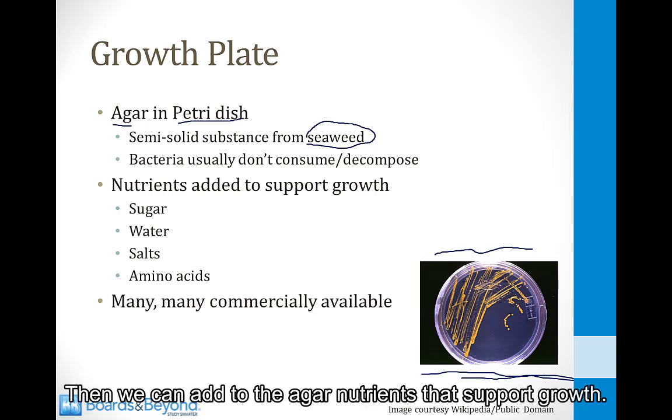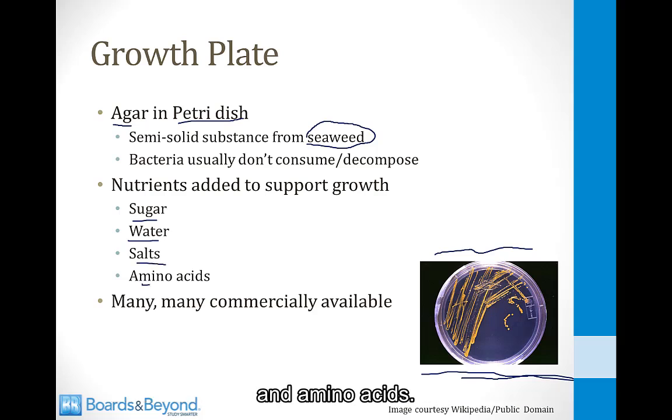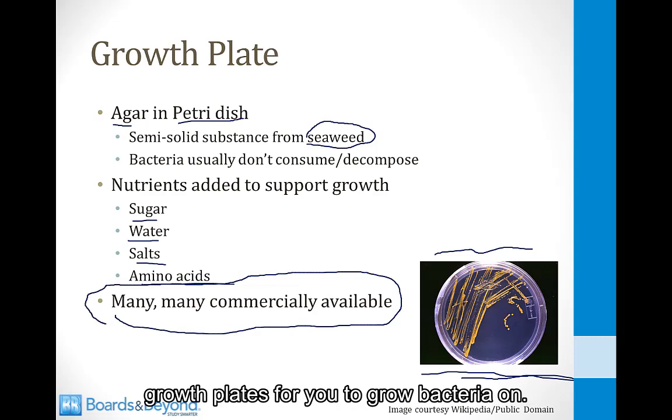Then we can add to the agar nutrients that support growth. So we add things like sugar and water and salts and amino acids. And there are lots and lots of commercially available growth plates for you to grow bacteria on.